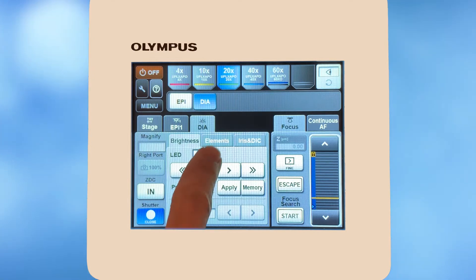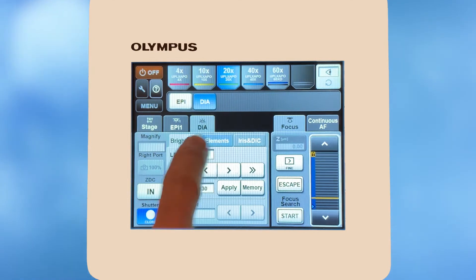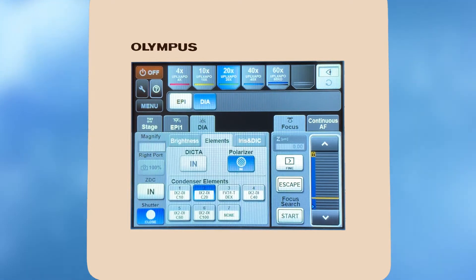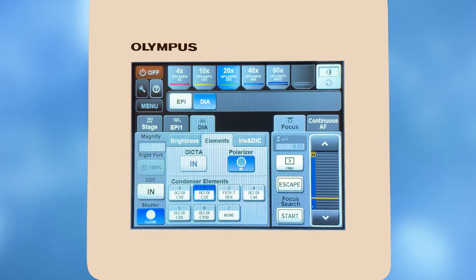To adjust your DIC elements, select the elements tab and adjust as desired.